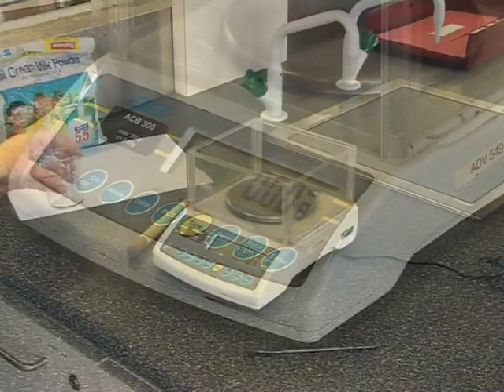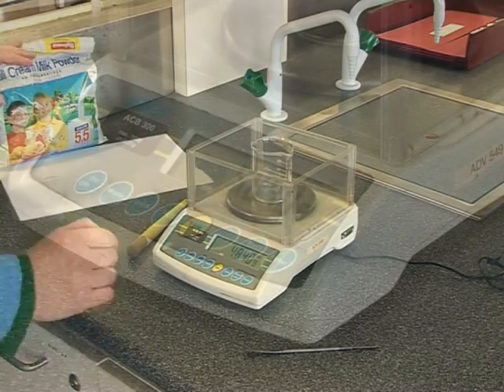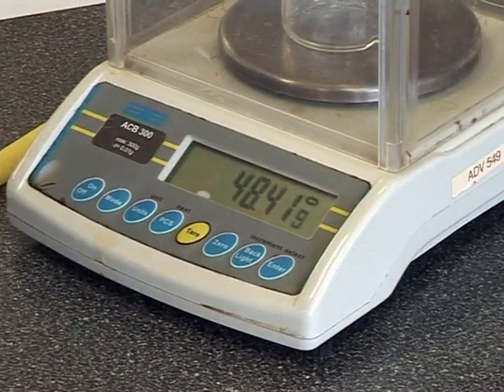Place a beaker or a watch glass onto the pan. Tare the beaker by pushing the tare button so that the balance reads zero.